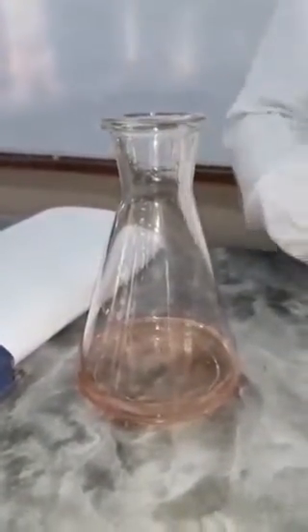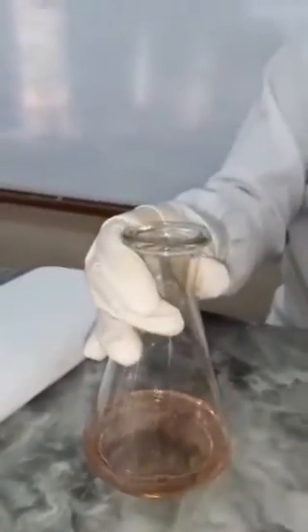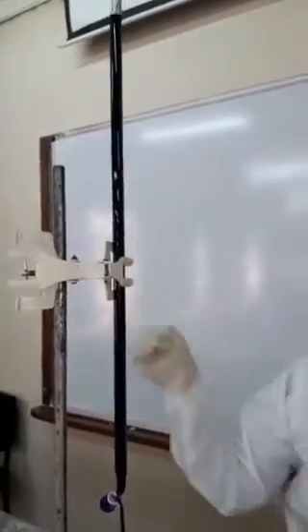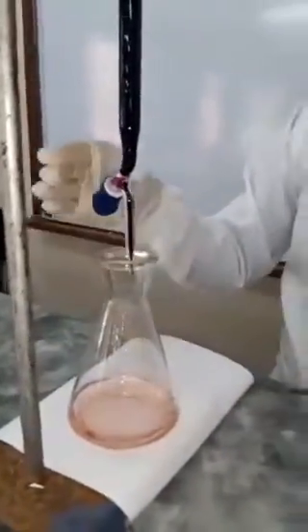The reaction for iron and potassium permanganate takes place in an acidic medium, so that's why you have to add acid. And then we're not going to add any indicator, because the potassium permanganate which we're using for titration is self-indicating. As you can see, it already has color, so there's no need for us to add any indicator. So we're going to proceed with the titration.